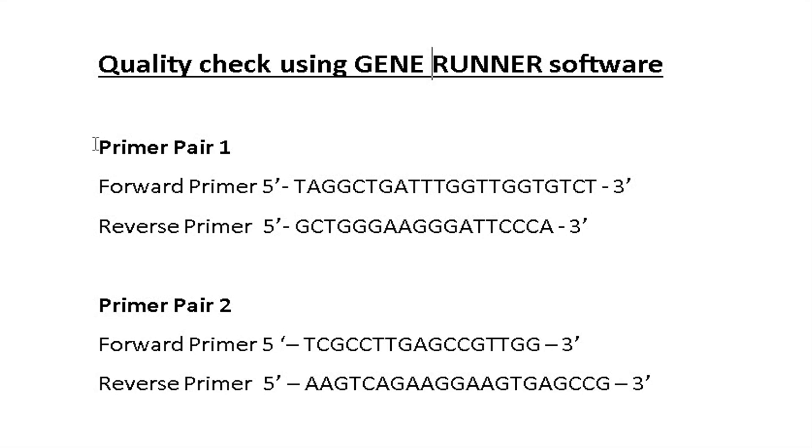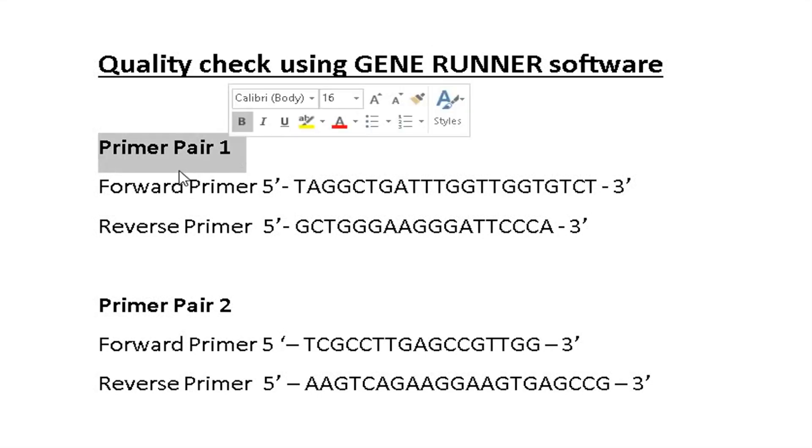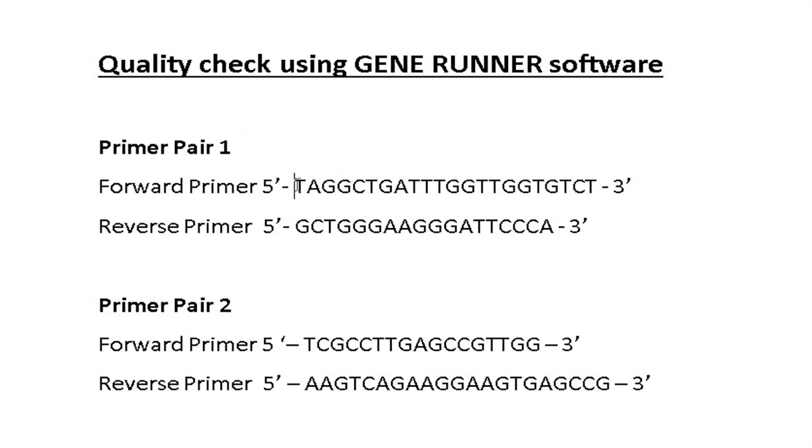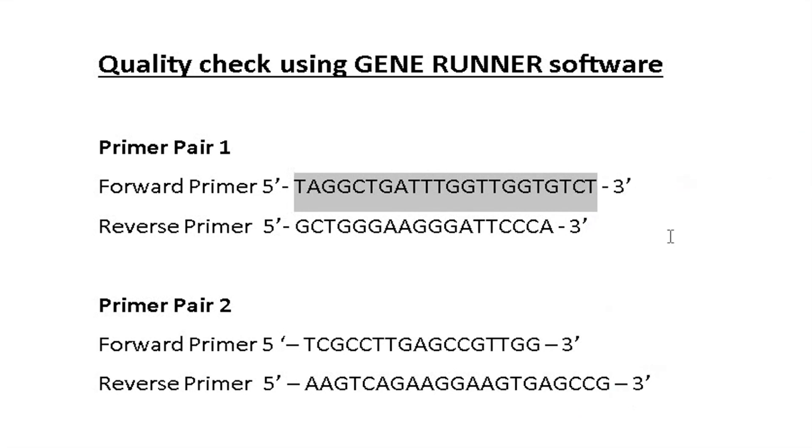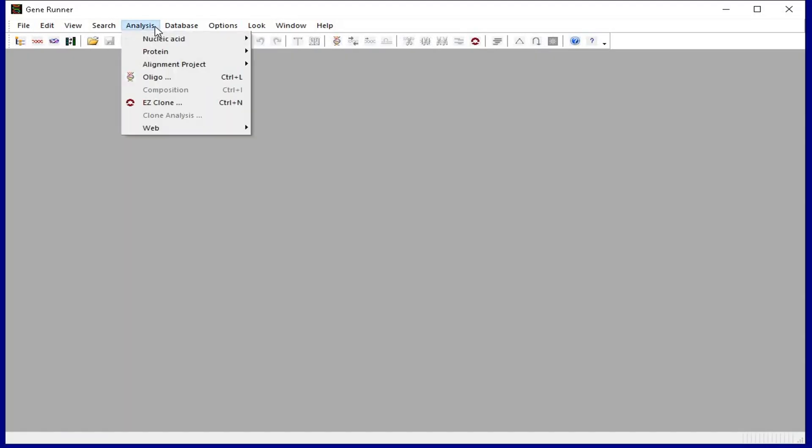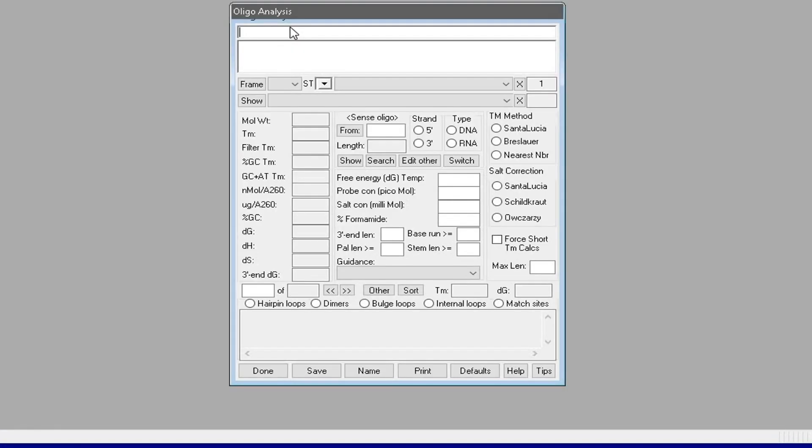Retrieve the sequence of one of the primer pairs. For instance, the forward primer from primer pair 1. Copy the sequence and head back to the GeneRunner software. Now, click on Analysis, Oligo, and paste the primer sequence.